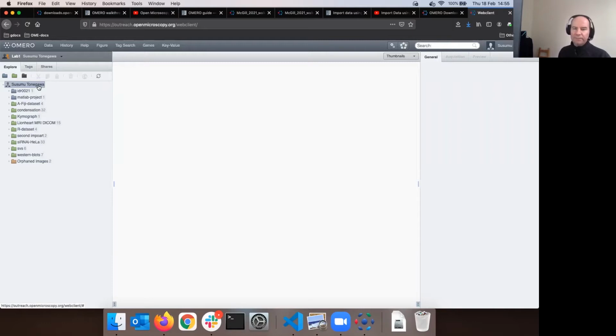And these are basically three pieces of information which are connected together. So user 49 is a login name, and in a normal world or more normal world, this is not a normal world, this is a workshop world, okay? So this is a teaching environment we are in all together, and it's streamlined to be a teaching environment, and all the quirks apply, of course, of teaching environment. The situation here is that you have, let's say, typically a login name such as S. Tonegawa.